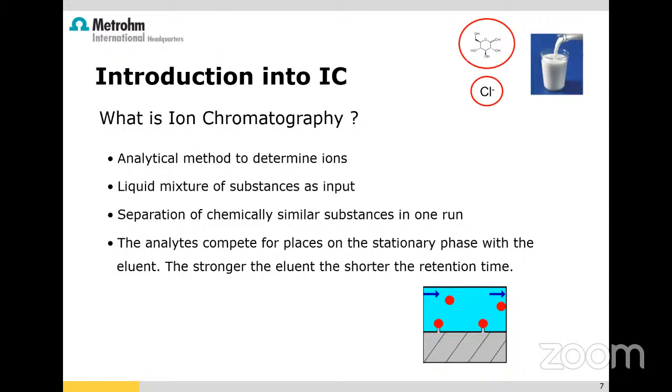So like that, chromatography is also an analytical technique, where input is always a mixture and output is the separated components of that mixture, which you can quantify or use for qualitative analysis. Majority, I'm sure, are aware of liquid chromatography or high performance or high pressure liquid chromatography, which is most used for analysis of compounds. Compounds meaning we have polar compounds, mid polar compounds, and non-polar compounds. So based on the polarity of the compound, we are doing the analysis.